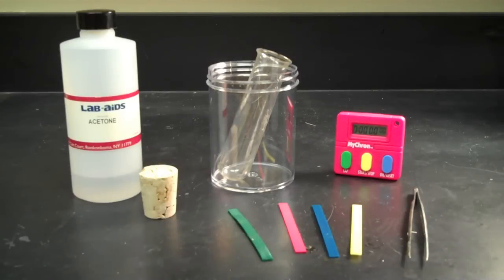In this video, we will demonstrate the effects of acetone on four different types of plastic. Before doing this experiment, we need to observe the characteristics of each type of plastic.